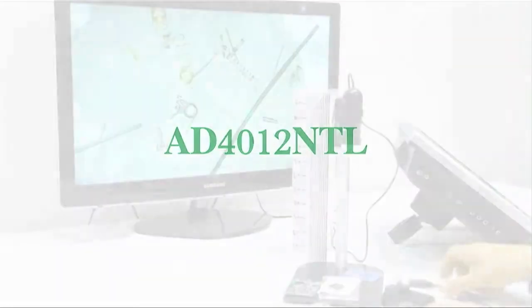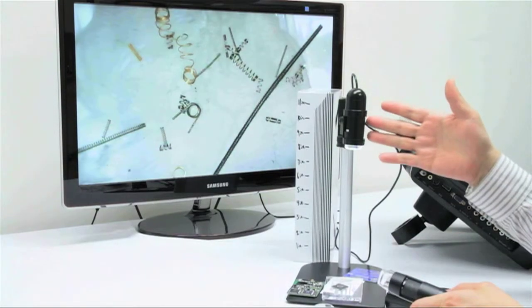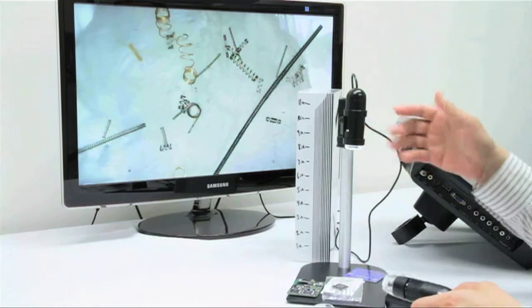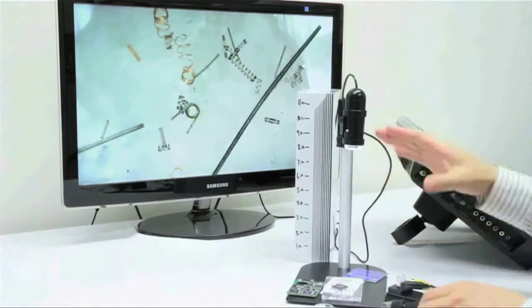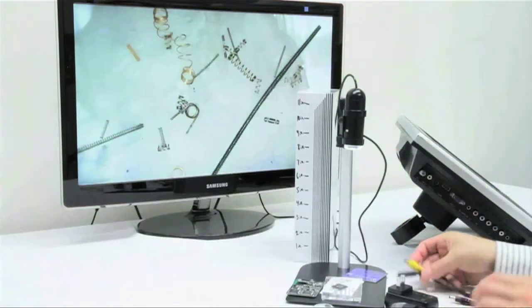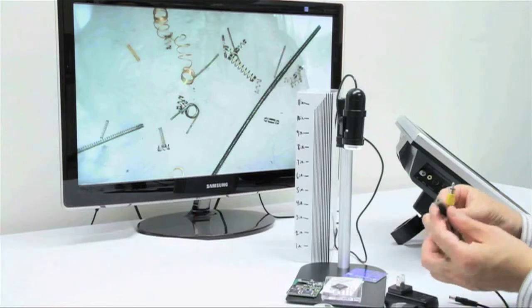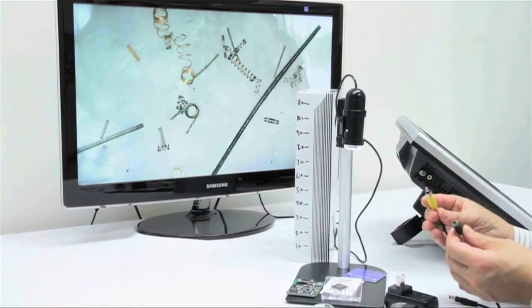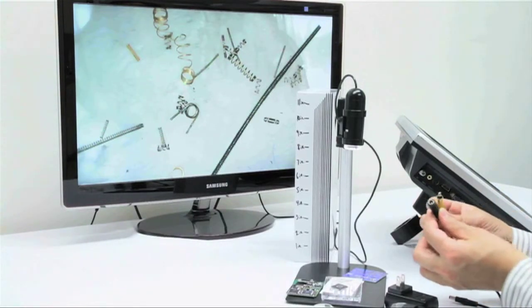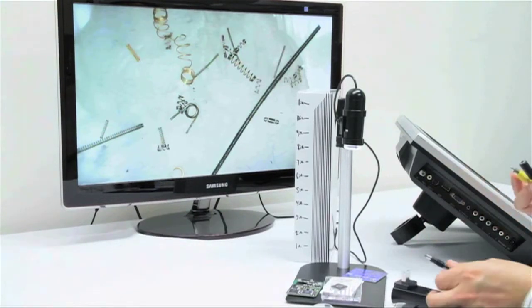Introducing the AD4012NTL. This is our longer working distance analog scope. Using the RCA connection to transfer data, this scope comes with an AC power supply needed to power this microscope.